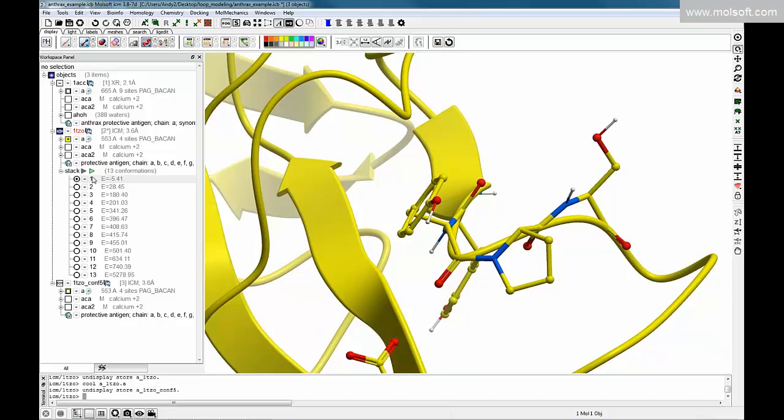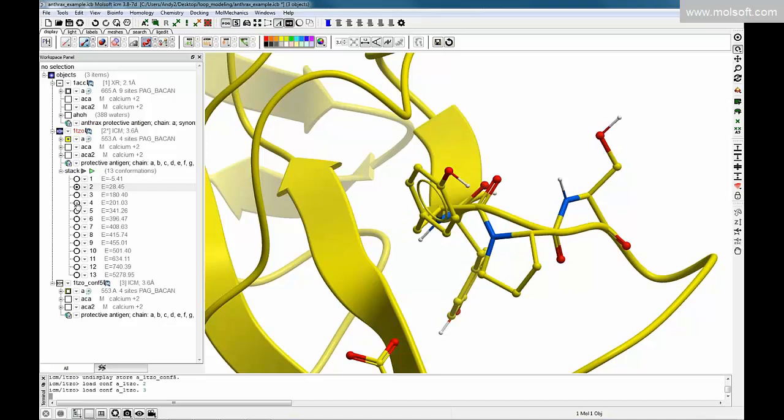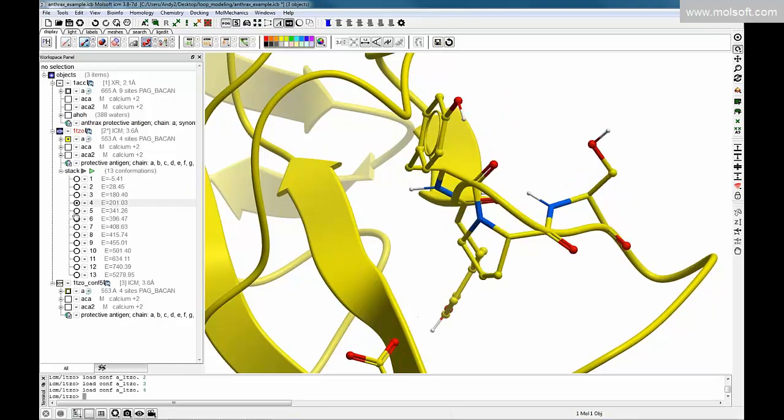Because it's actually searching the PDB database, and this PDB is actually in our database, it does find the loop even without the global optimization simulation. It obviously finds that loop from 1TZO and it maps it on. But obviously in a real modeling example, you're not going to find the exact match. So this is a way to toggle through your different loop conformations.